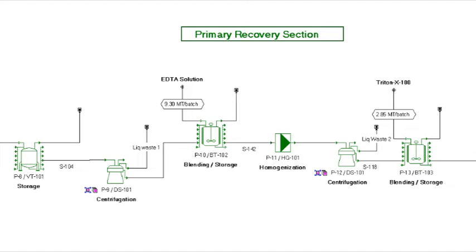Operation Unit 14: Centrifugation DS101. The inclusion body slurry is washed with WFI containing 0.66% Triton X-100 detergent and centrifuged with the previous centrifuges to recover its slurry volume at the end of the primary recovery section, around 1400 liters.